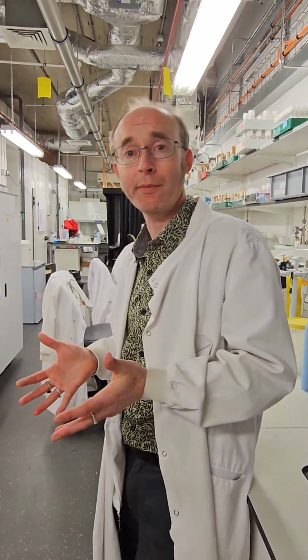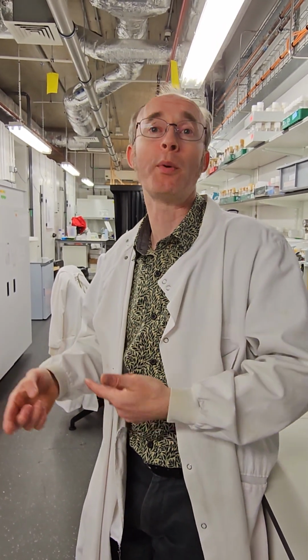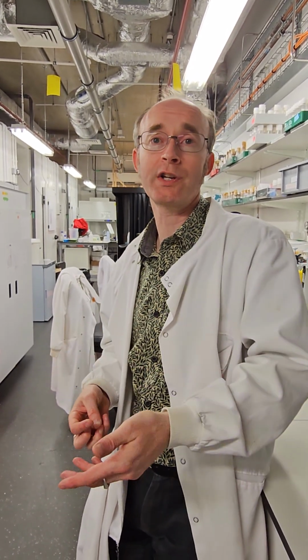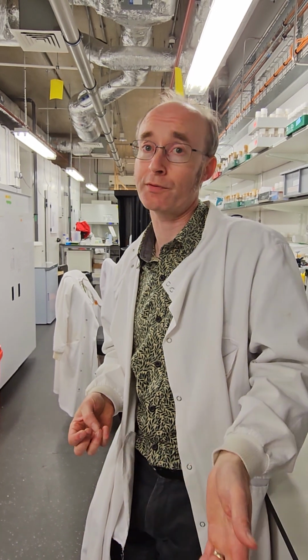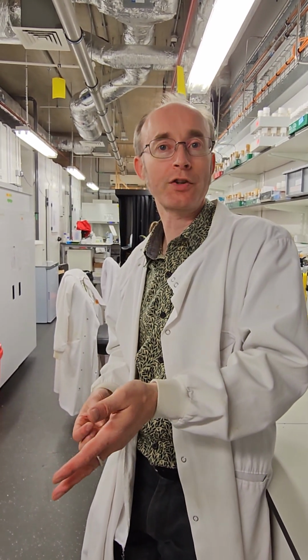and 37 degrees is our body temperature. So if you're trying to find a model organism where you can study the infection dynamics of a particular pathogen, like a nasty bacterium, it's not ideal to use a model that grows at 20 degrees, because the bacteria themselves will be growing at our body temperature. So we can use those wax moths as an alternative to using mice and rats for experiments, and use those to study infection and immunity.